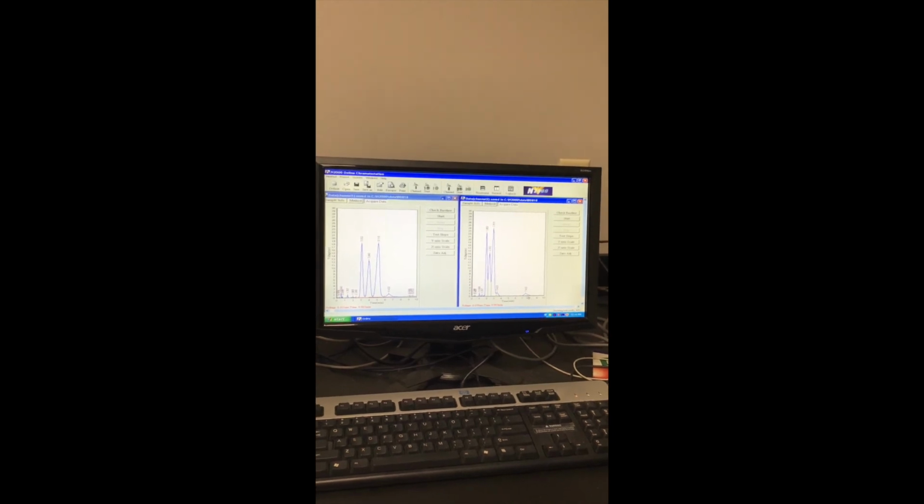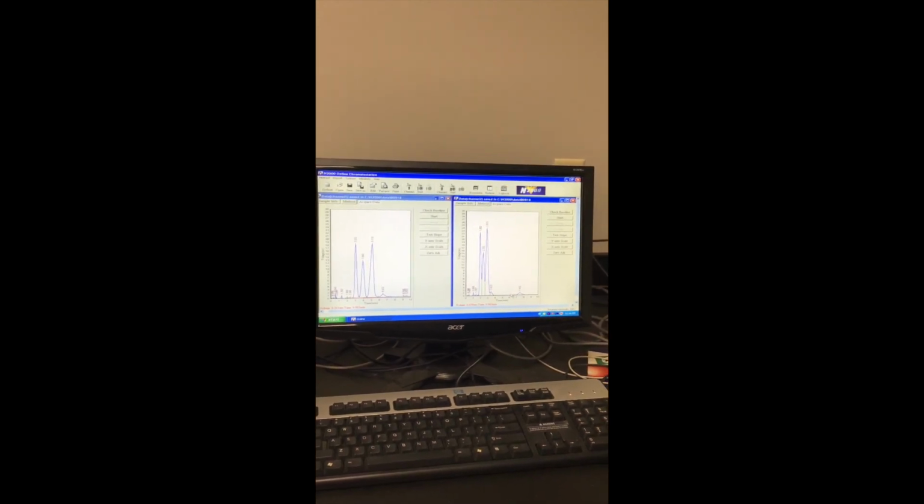You're going to have to keep an eye on the stuff that's coming through to verify if it's at its endpoint or not. And so had we stopped over here, say that we use this as our reference and we stopped at 6.4, well, we would have missed this little hump over here at 7.4 because we thought it was done too early. So we'll have to keep that in mind whenever we're actually running the GC that you're going to be running, how long it's set and how fast it runs things through.